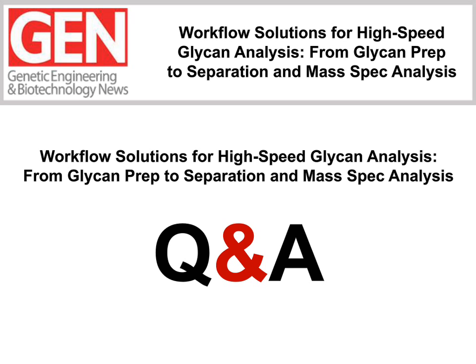Okay, thank you. Sonia, I have a question for you. Can online mass spectrometry be used to distinguish between glycan linkage isomers, for example, 2,3 versus 2,6 linked sialic acids? Well, the type of online mass spectrometry that we discussed cannot distinguish between those linkage isomers.